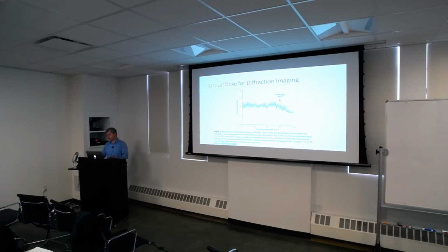In a way, this agrees with our low dose single particle imaging. Quite often you're cutting off below 20, since above 20 electrons per square angstrom you should be dampening the high resolution information. That's why they do all this fancy dose weighting. But that's total dose, right? This is total dose, yeah. So for single particle, you'd probably be an order of magnitude above this. Indeed, yes. For the whole picture we're normally shooting around 50 to 70, but now we can also fractionate the dose. So we're a lot better than we used to be.